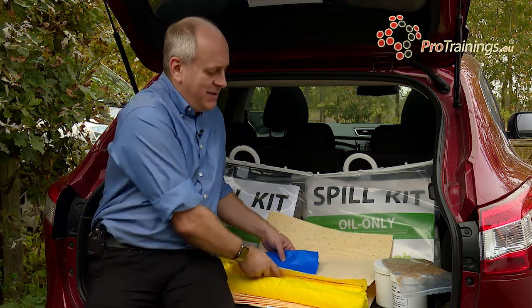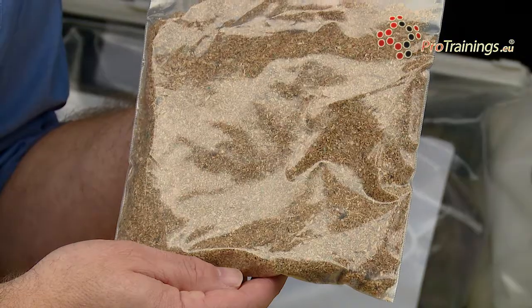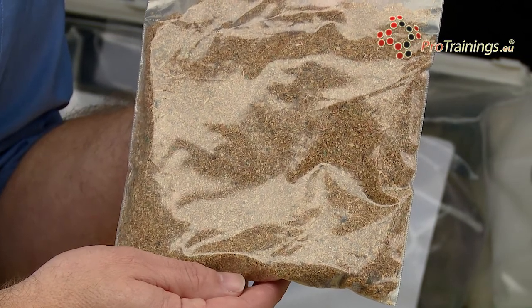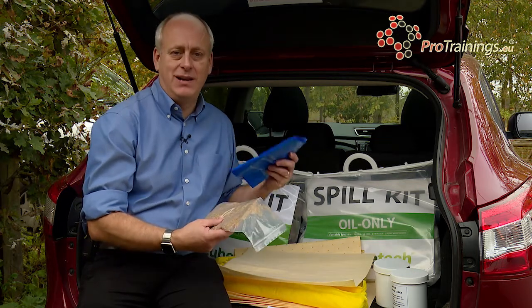Another substance you can use for clearing up chemicals is the granules. These granules are sprinkled onto the substance and will absorb into the granules. Once you have done this, you can brush or shovel them up. Again, when shovelling up, make sure you put all the waste products into the bag.